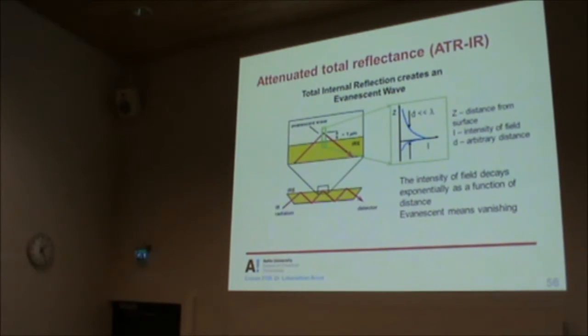It's simple infrared spectroscopy, but here it depends on the electric field generated by the evanescent wave. So this is absorption by molecules during reflectance. Because it is getting absorbed, we use the word attenuated, because the intensity is lost.